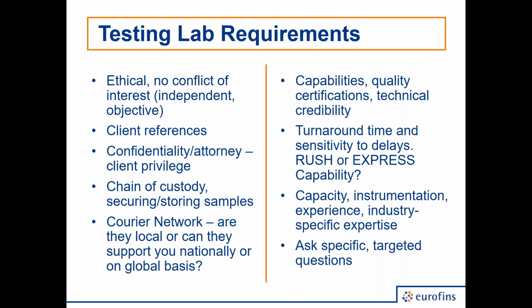Are there passcodes? Are there security systems? Are there monitoring systems? How do I know that my samples aren't commingled with my competitors' samples? How do I know there was no funny business or tampering from the time a sample was received? So all those things, you should ask questions and ensure that your partner has those in place.